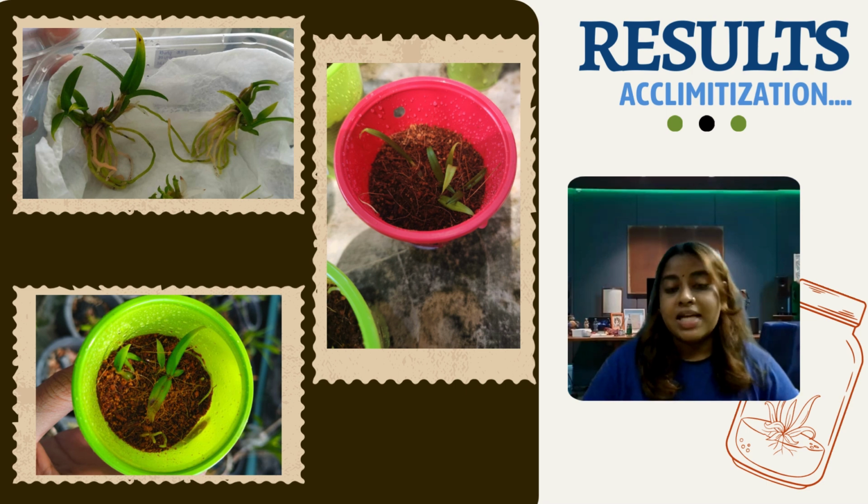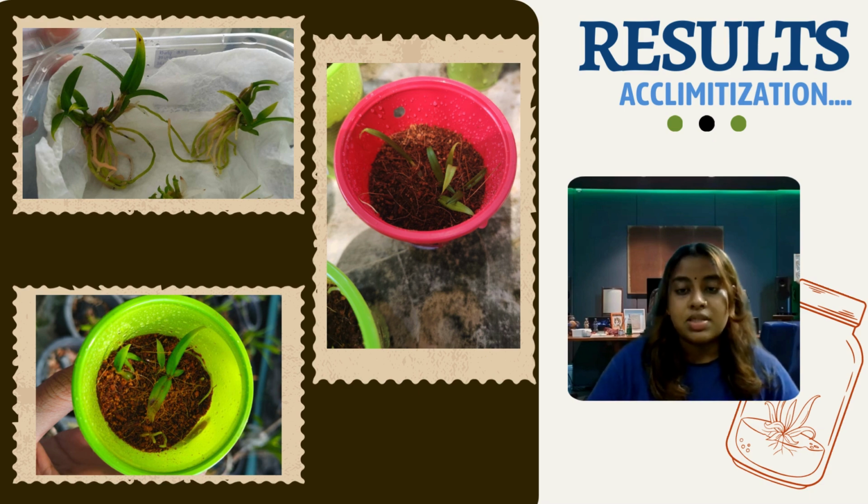This is the result for the acclimatization. In the first picture, we can see that there are developed roots and also leaves. The second and third pictures show the final stage of the acclimatization. That is, after the mid stage, we took the plant and transferred it to the nursery. So we can see the developed plant and also the roots there.